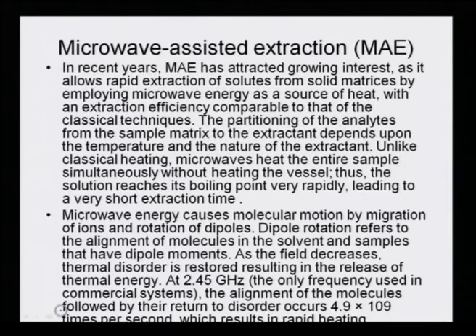The partitioning of the analytes from the sample matrix to the extractant depends upon the temperature and the nature of the extractant. Unlike classical heating, microwaves heat the entire sample simultaneously without heating the vessel. Thus, the solution reaches its boiling point very rapidly, leading to a very short extraction time.